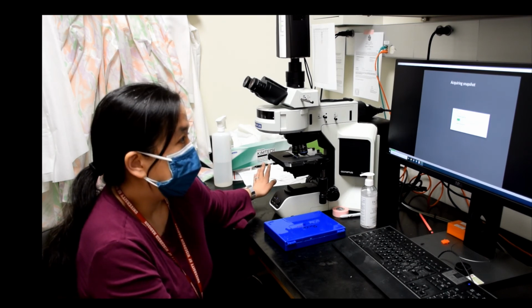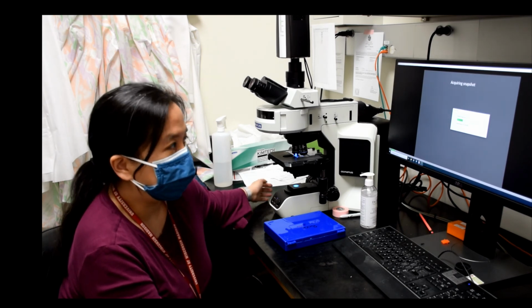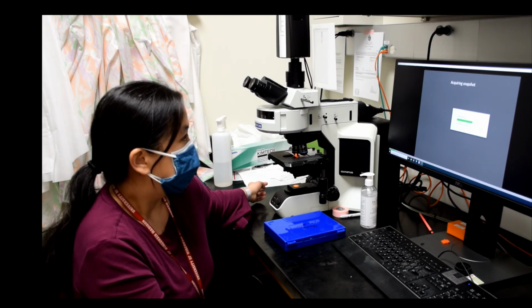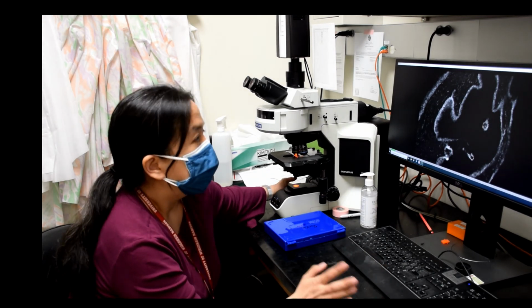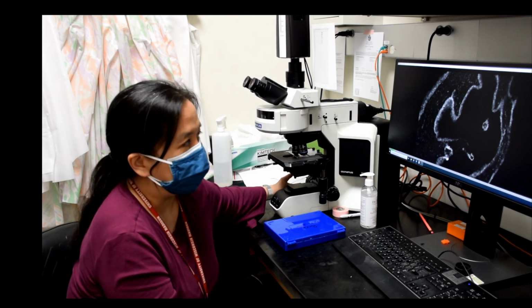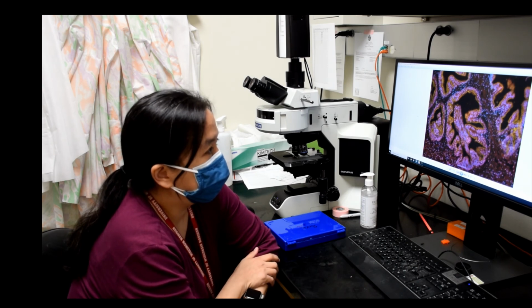and so what the microscope will do is, for all the channels that I showed you earlier, it will take an image at each of the channels, at each of the light wavelengths, and then it'll put it together to give us one picture that we can then pull out and look at the protein expression in each of the channels. So now this picture is done. Because these are fluorescent proteins, we don't want to shine light on it for very long, because the fluorescence will start to diminish. So we'll close the shutter and I'll show you what an image looks like that we've already taken.